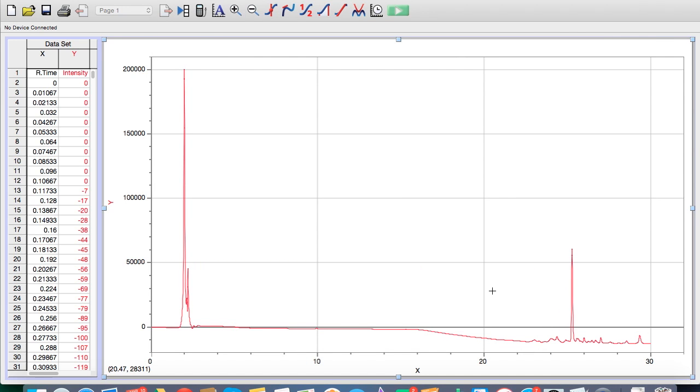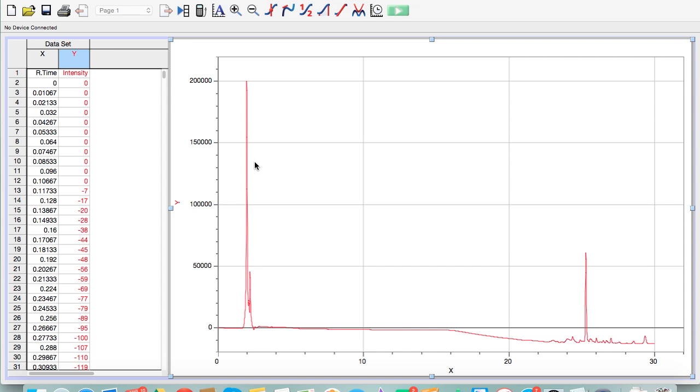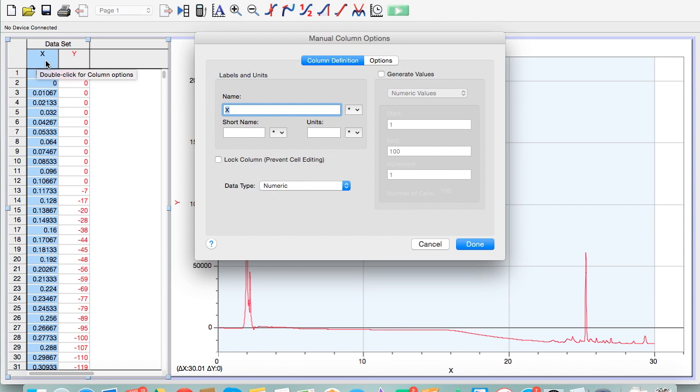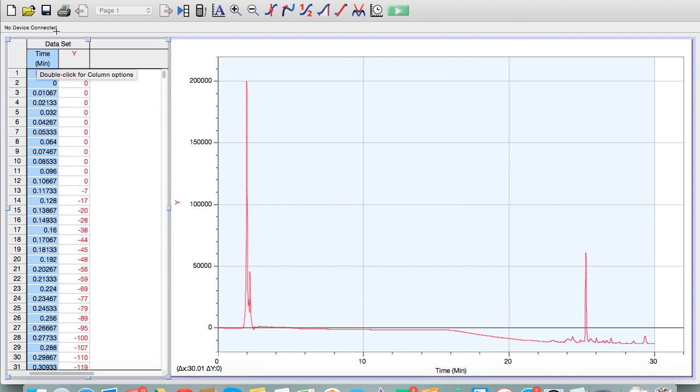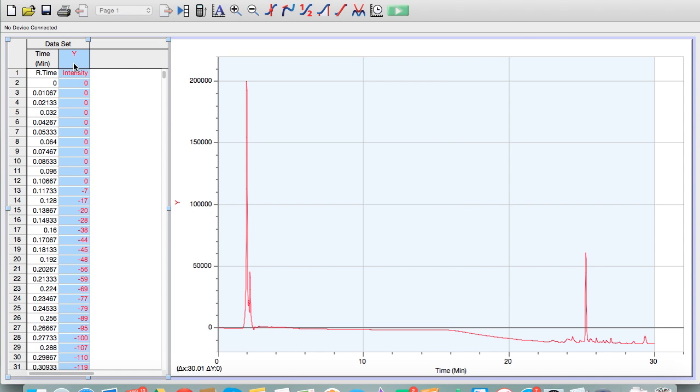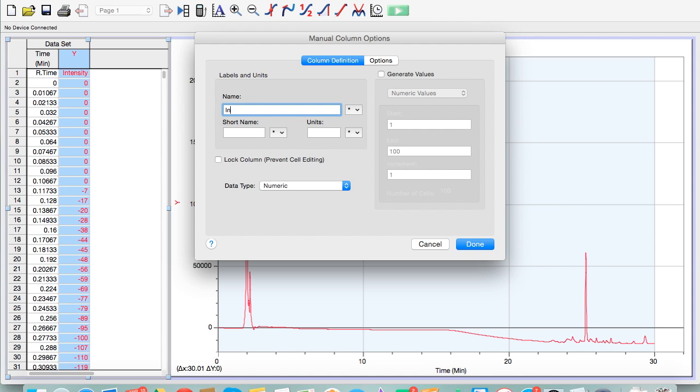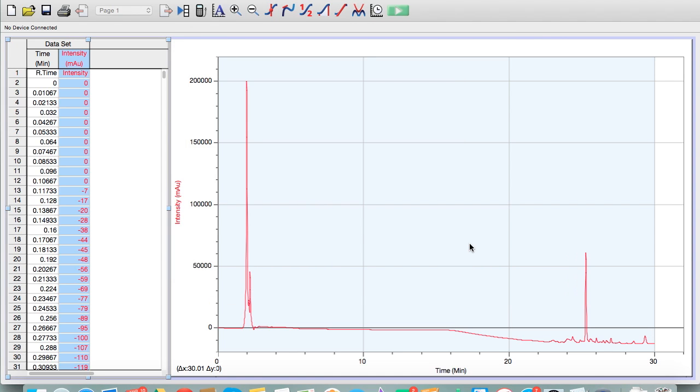Now once you have your data in Logger Pro, you're going to want to clean it up a little bit. First thing you always need to do is label the data. Go up here to the left on X, double click. We're going to call X time because that's what it is from the HPLC data and this time is in minutes. Then Y values, that's intensity, and the units are millie absorption units.